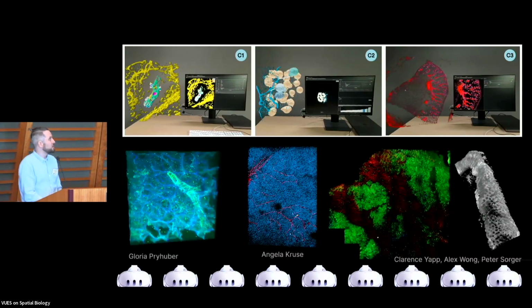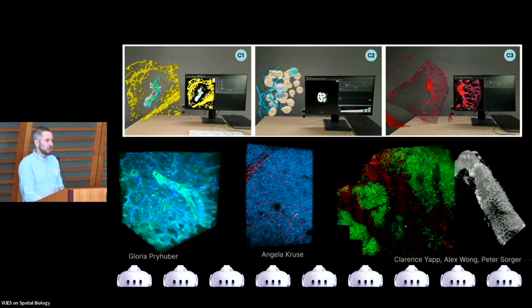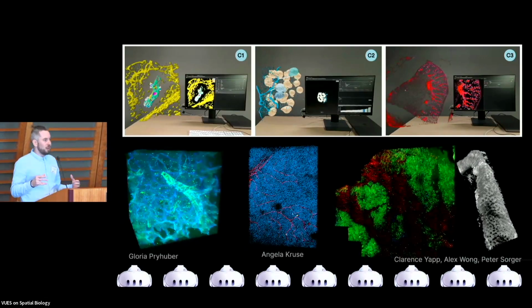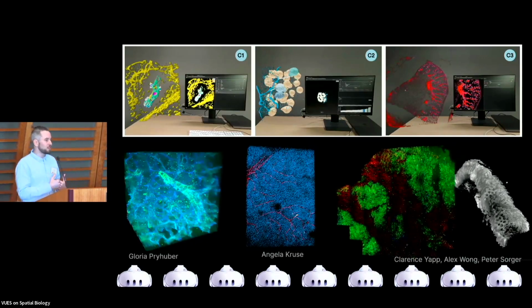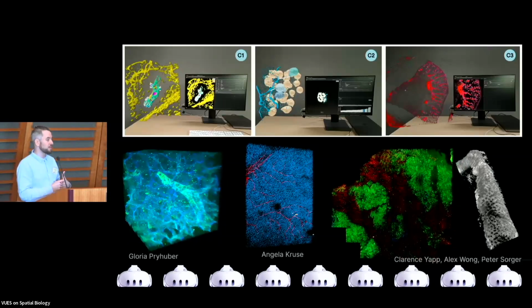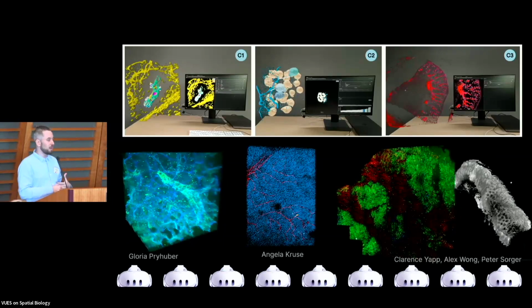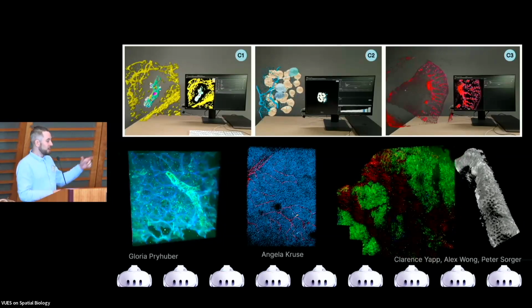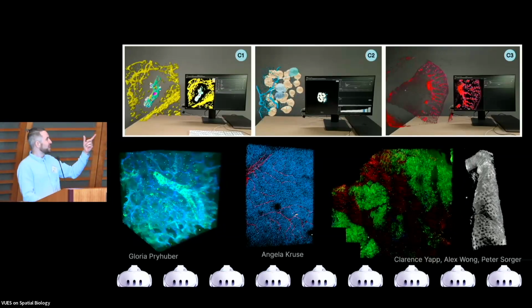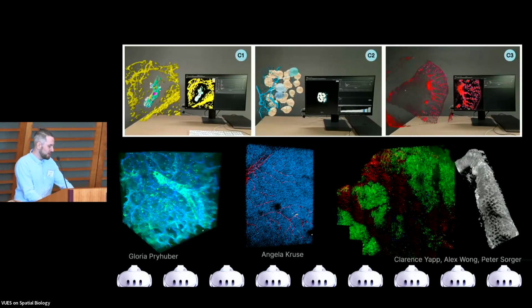So we're very fortunate to now have a large set of example data and people giving us feedback, and to have this continuation of people using our tool and then just giving us feedback where we can get better, where are the friction points, what are they using it for, and what do they appreciate in XR over a standard 2D display. And so you can see a lot of names that actually presented today. So I was always happy to spot some of the data sets that I've seen before being shown in our XR tool.